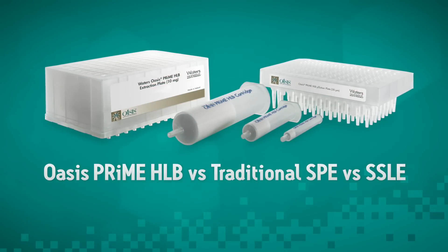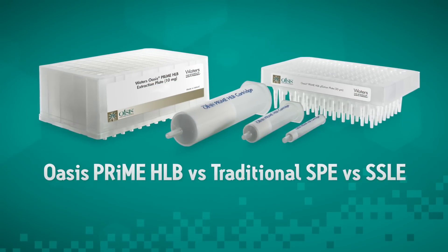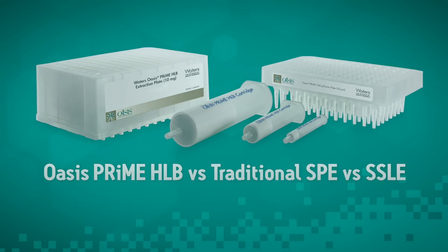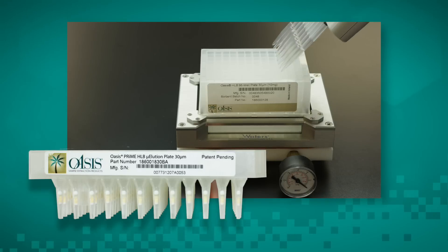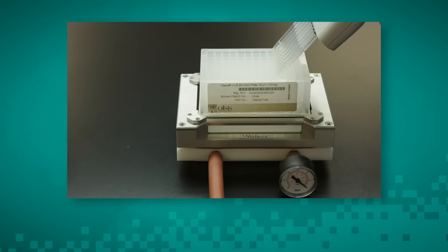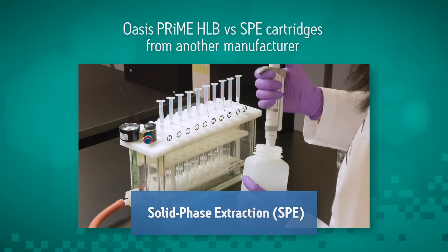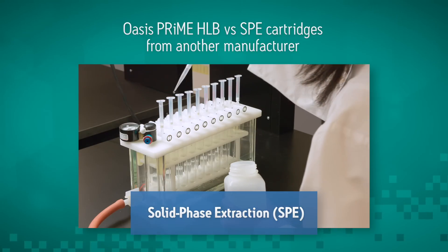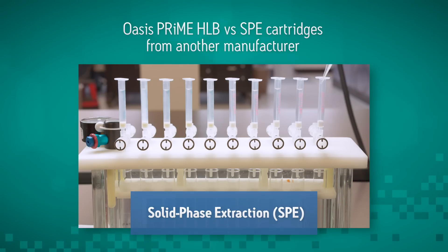Oasis Prime HLB makes sample preparation simple compared to other solid phase extraction products and cleanup methods. Available in both cartridges and 96 well plates, you can choose the configuration that best suits your needs. Let's take a look at the difference Oasis Prime HLB can make in your solid phase extraction workflow compared to an SPE device from another manufacturer.